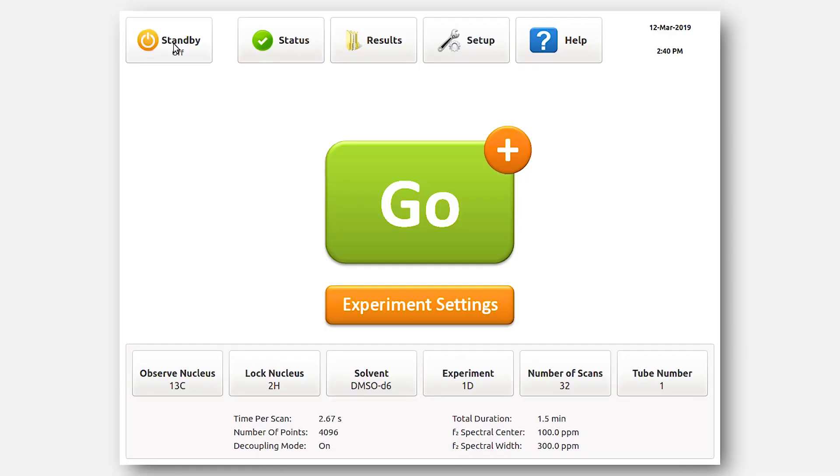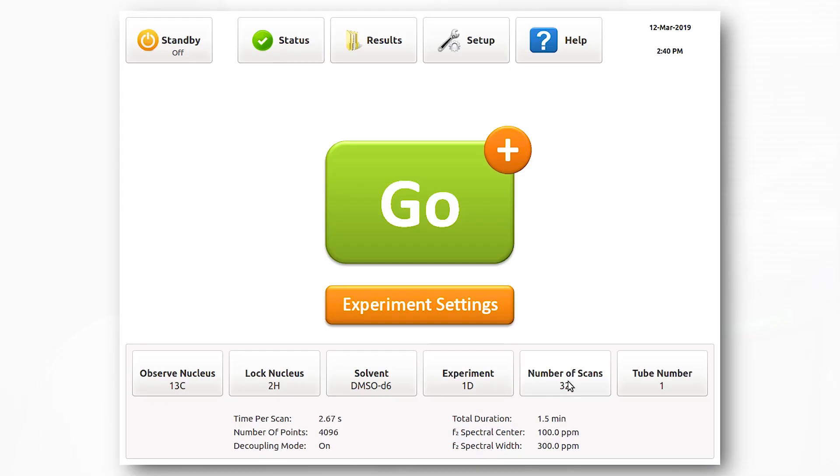Now we can quickly adjust several parameters on the main screen. For observed nucleus, change to carbon-13, lock nucleus, change to deuterium, solvent, DMSO-D6, experiment, 1D, and number of scans, 32. More advanced parameters can be changed in the settings tab.